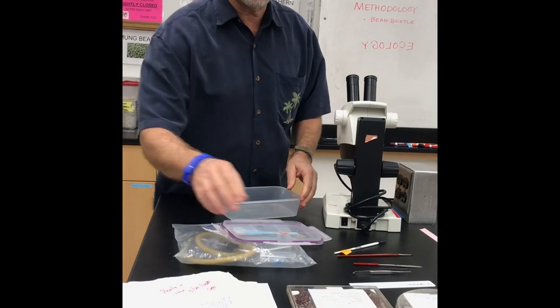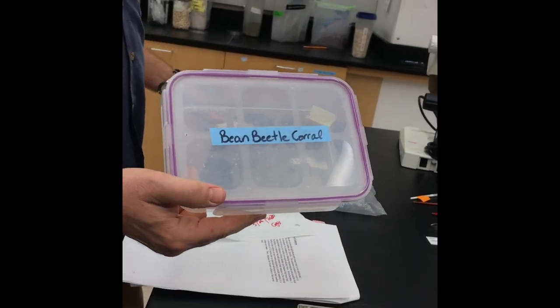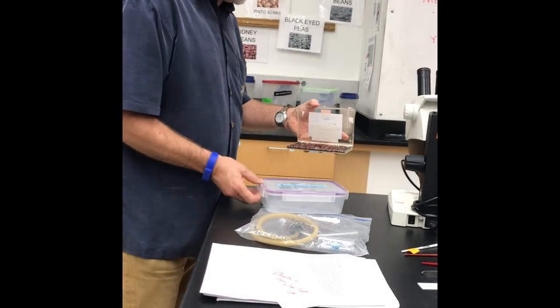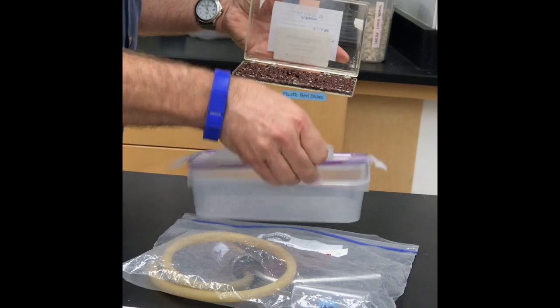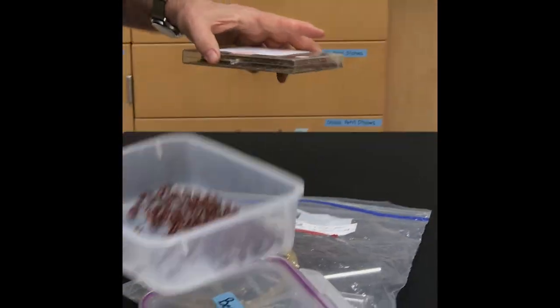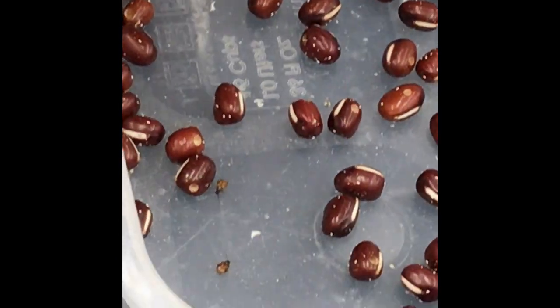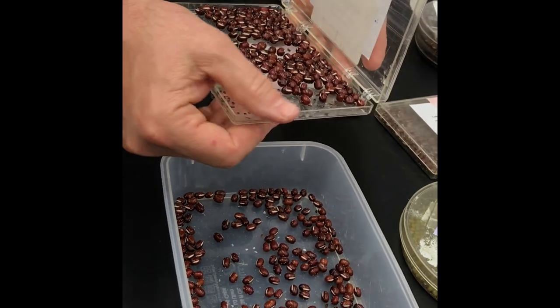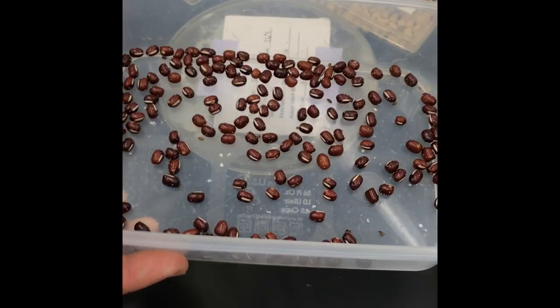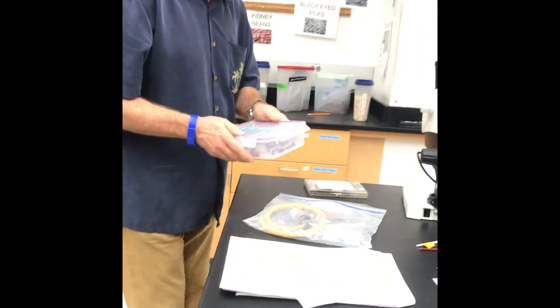Basically, what we would do is take what we call a bean beetle corral. I'll take one of these petri dishes that have had the bean beetles in them, and put about half of them in a corral — it's easier to catch them when they're spread out a little bit. You can see these are a little frisky. The first thing I want to look for is bean beetles that are pretty lively. I'm going to put this lid on here until we discuss the next important tool.